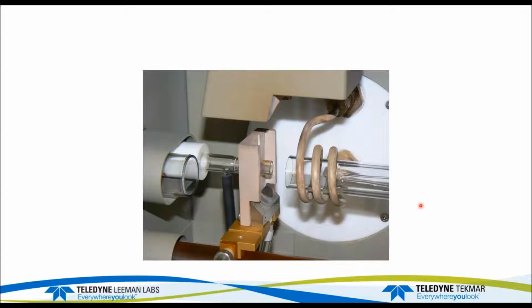Without the plasma being on, you can get an idea how close the intermediate or the auxiliary tube is. That's why I'm using the higher auxiliary flow. And you can see this purge tube to the instrument actually extends through the knife. There's an air knife here to cut the top of the plasma off, and that helps keep this quartz cool so it doesn't melt, even though it's actually in the plasma.